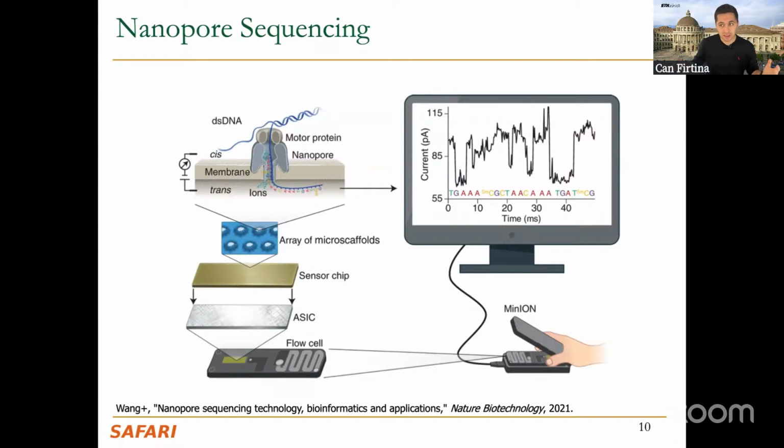This can be the same, which is not necessarily the case, but usually different copies of DNA in parallel at the same time. And if you look more closely at a single pore, what you're going to see is potentially a three-layer solution. We have a top layer, a membrane, and also a bottom layer. I'll explain these later on in the later slides.